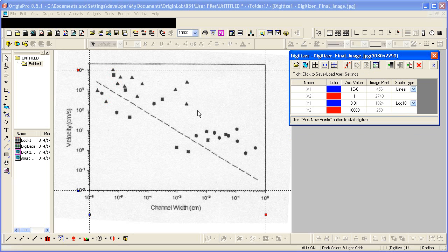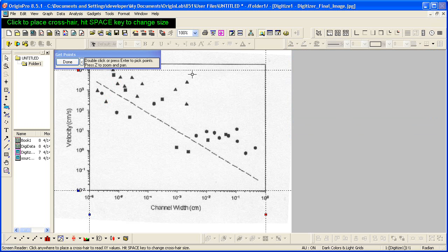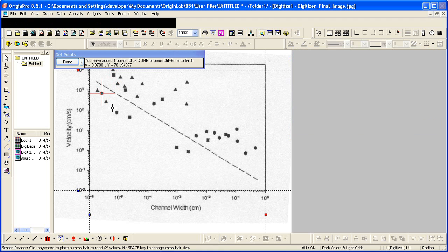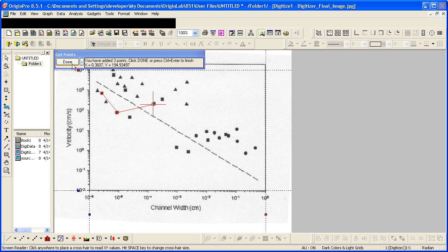So start new data clears things for me. And then I can pick new points. Let's go ahead and grab these circles. Hit done.